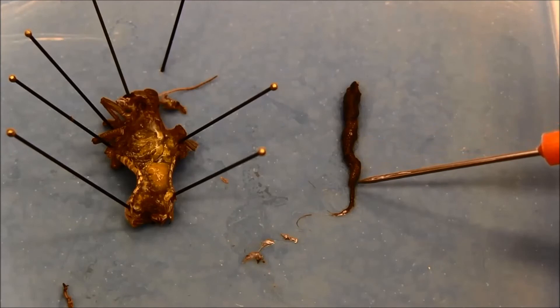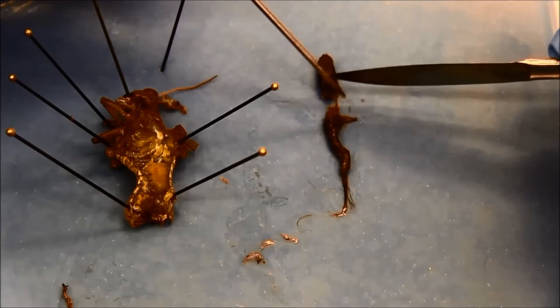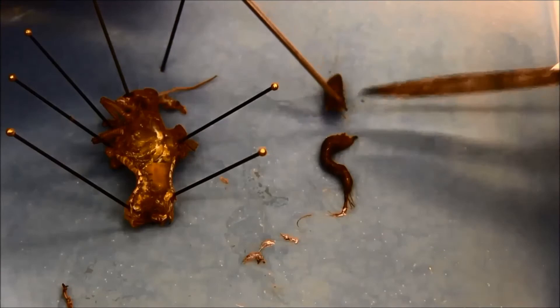Once I find the border between the fore gut, mid gut, and hind gut parts, I use a scalpel to separate them.